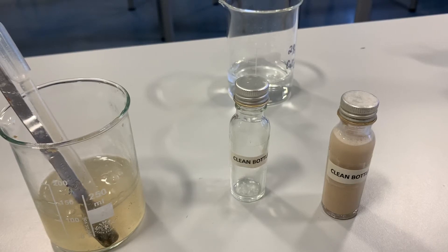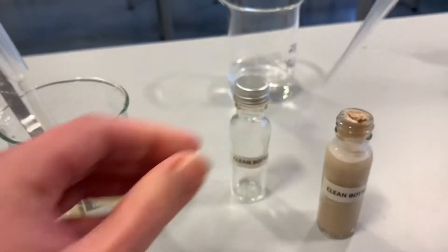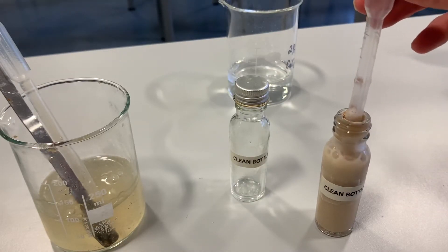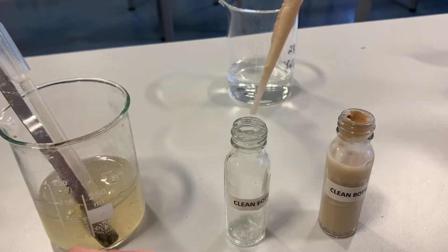We've made a 10% stock solution of yeast by adding 2.5 grams of yeast to 25 centimetres cubed of distilled water. What we're now going to do is take 2 centimetres cubed of that out and draw it up into the syringe until we've got our two, and we're going to add that to our clean bottle.